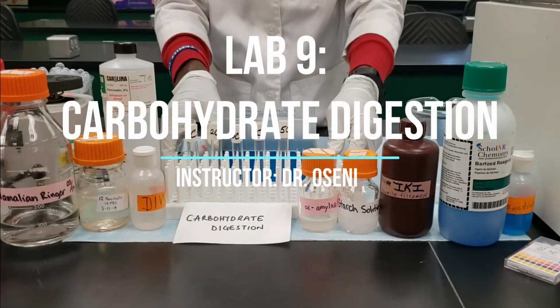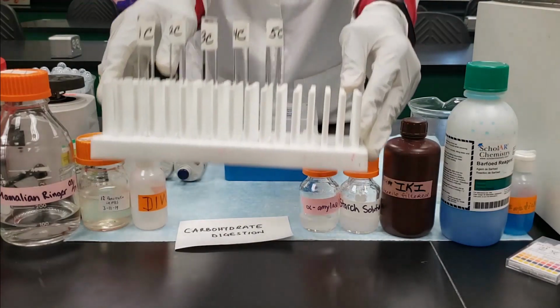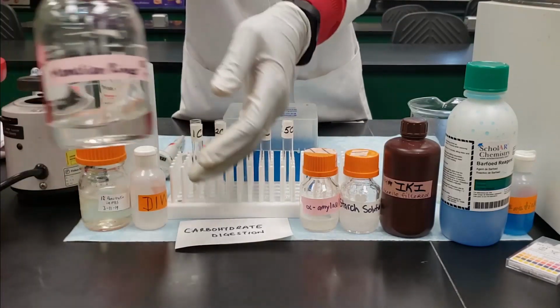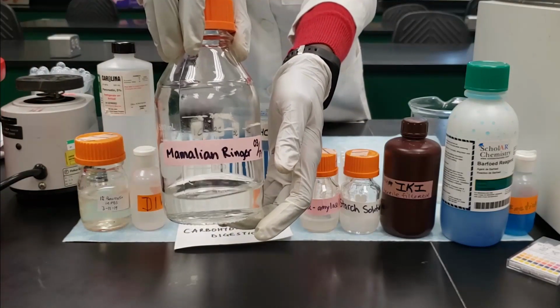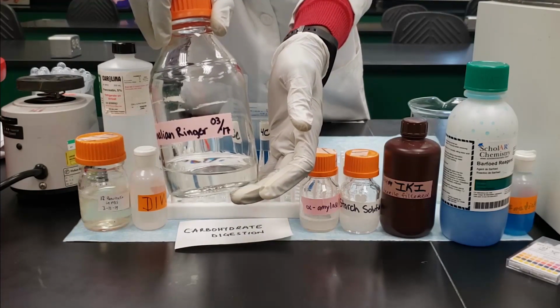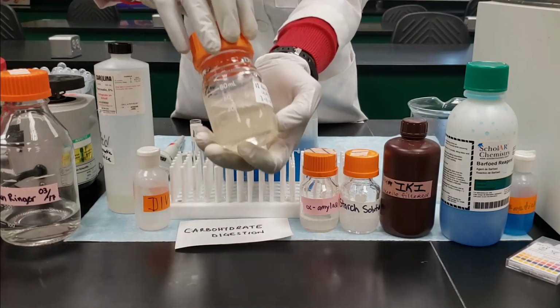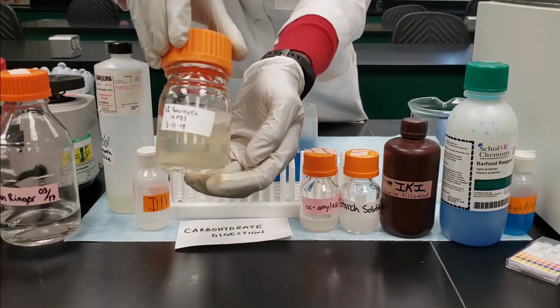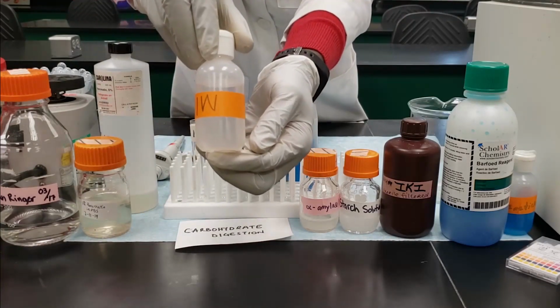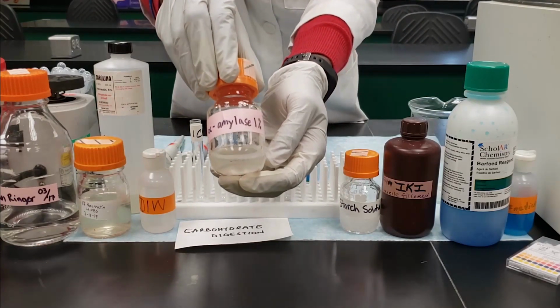So the first experiment that we want to do is carbohydrate digestion, and we need 5 test tubes for that, labeled 1C to 5C. And the second material is the Ringer solution, and we're going to be adding that to all of our tubes at the beginning of the experiment. And then the next thing is you need to have your pancreatic juice, which contains the alpha amylase and other enzymes.